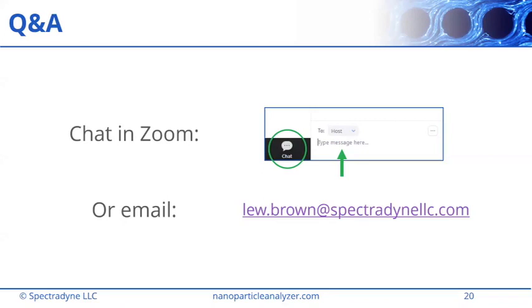The second part of your question was about whether the instrument requires a blank to compare the samples to. And so measuring blanks is a really important question, mostly from the perspective of, if you're diluting your sample into a diluent that contains particles itself, then at some point you'll dilute your sample below the background of particles in your diluent.